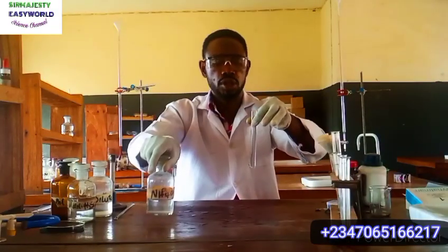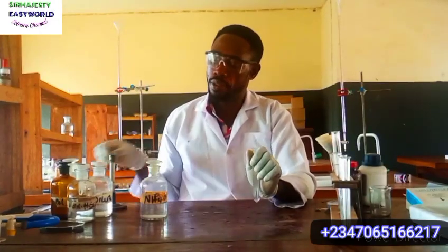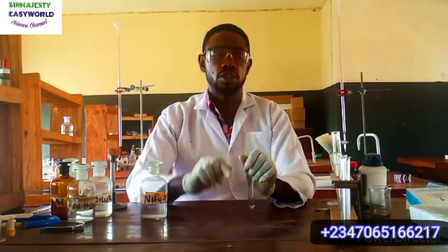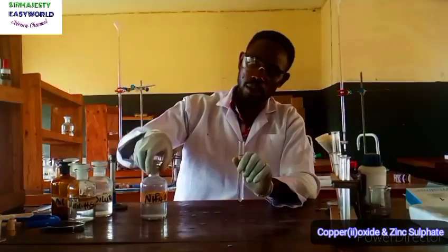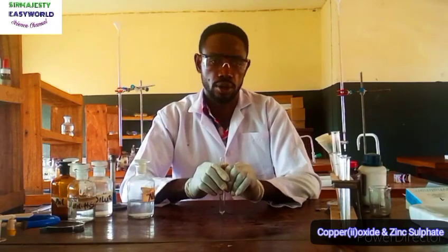Remember, this is aqueous ammonia. So we observe the same thing when we use sodium hydroxide and aqueous ammonia. And when I used sodium hydroxide, I told you that you suspect aluminum, lead, or zinc. But mostly, if it is gelatinous, it should be zinc or aluminum. But when the same result is observed with aqueous ammonia, you confirm zinc ion.